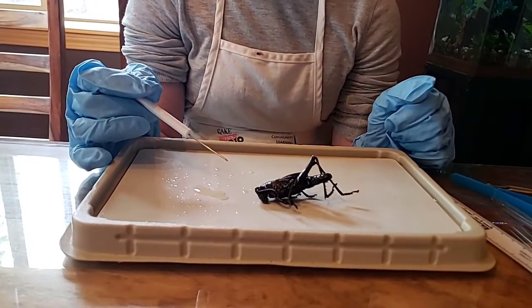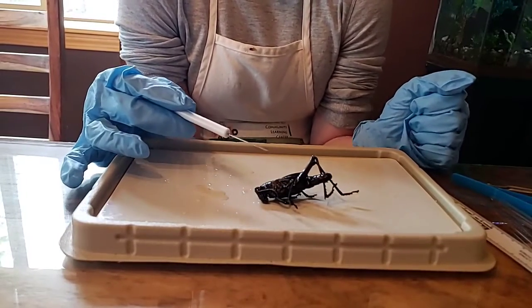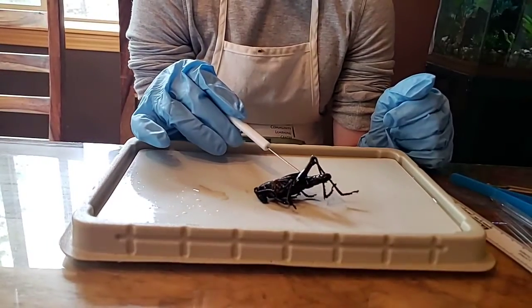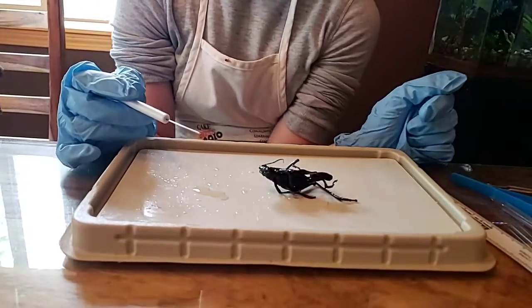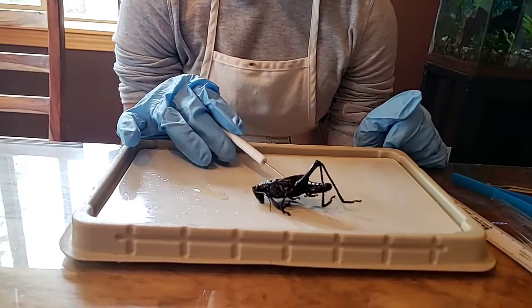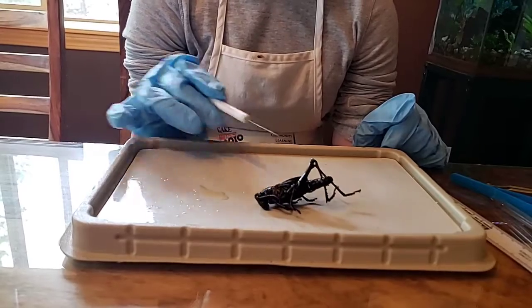It also says that the 2 thorax segments have a pair of wings. So look at these wings. Do you see the wings coming up off the tops? Lanston, please don't fool around with your specimen. All right, so not only are the legs attached at the bottom, but then there are wings attached at the top. Correct? Yeah.